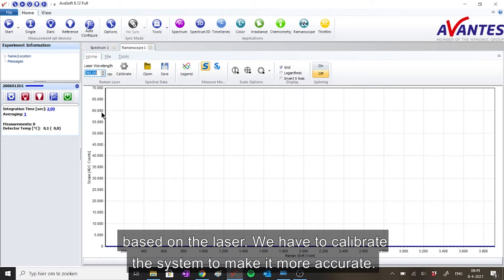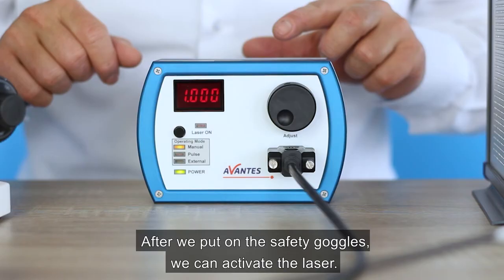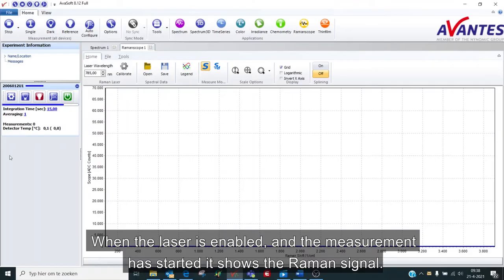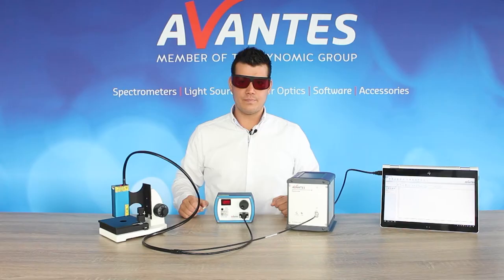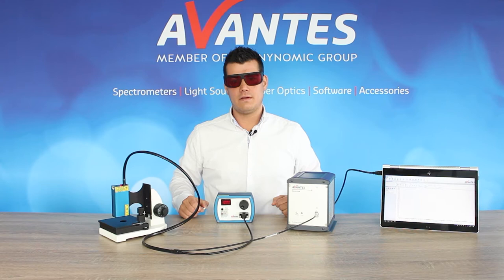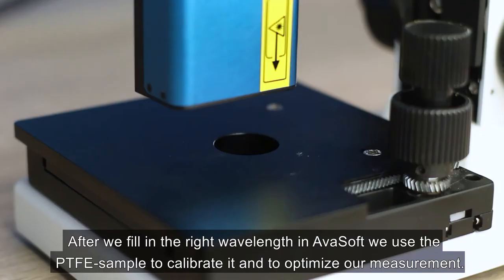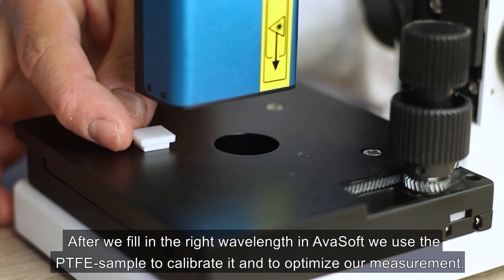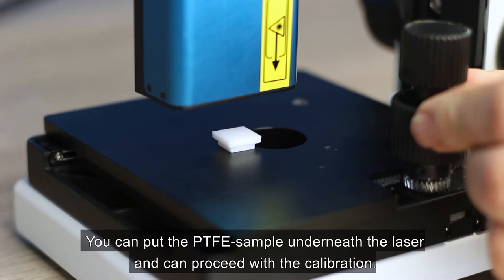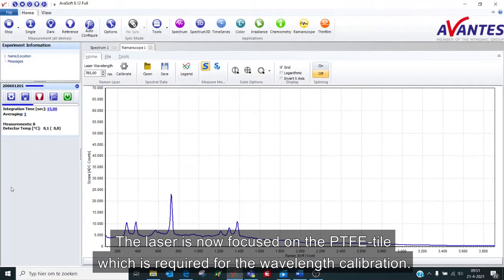After we put on the safety goggles, we can activate the laser. When the laser is enabled and the measurement started, it shows the Raman signal. After we fill in the right wavelength in AvaSoft, we use the PTFE sample to calibrate it to optimize our measurement. You can put the PTFE sample below the laser and can proceed with the calibration. The laser is now focused on the PTFE tile, which is required for the wavelength calibration.